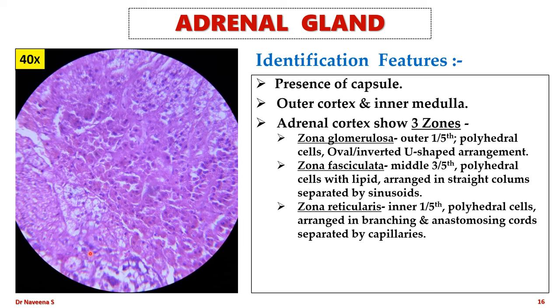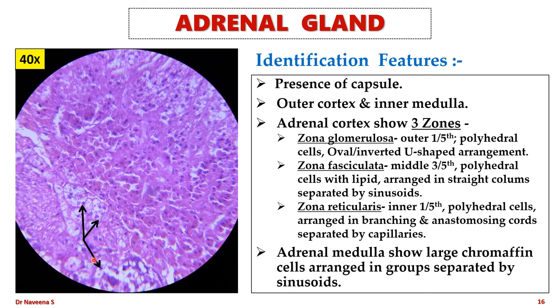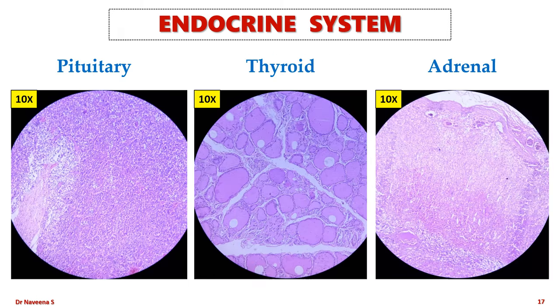The adrenal medulla contains large polyhedral cells called chromaffin cells, which contain chromaffin granules in their cytoplasm. They are arranged in groups separated by sinusoids, belong to the sympathetic system, and secrete catecholamines. To summarize the endocrine slides: pituitary is identified by clusters of cells in pars anterior, colloid-filled vesicles in pars intermedia, and nerve fibers in pars posterior; thyroid by lobules with colloid-filled follicles and parafollicular cells; adrenal gland by its capsule, three zones in the cortex, and large chromaffin cells in the medulla.